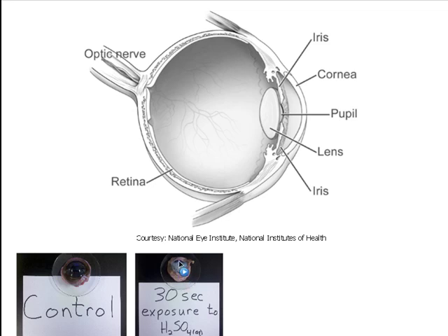With 30 seconds of exposure to sulfuric acid before you're able to rinse the eye, you can see the considerable damage that has been caused. That white area you see is opaque — that corresponds to the cornea area in the diagram — and being opaque, light can't pass through. So light would not be able to get through the pupil back to the retina, and this eye would pretty much be blind. That is permanent damage and it can't be washed off. It's very similar to when you fry an egg — that clearish milky substance, the egg white, when it hits the heat of the pan, the heat reacts with those proteins and alters them into the solid white color you see. You can't undo that change, just as you cannot undo this change.